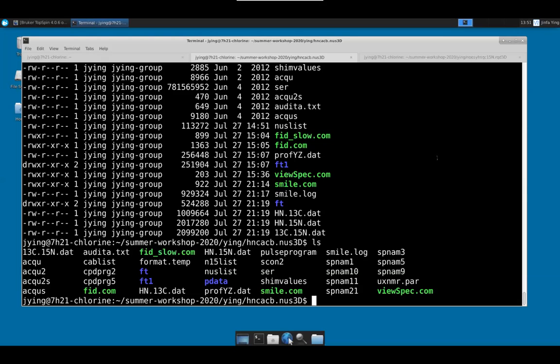The default is 6.5 microseconds. You could set it to 30, 40, and of course that will screw up your linear phase, but you could actually compensate for that in the pulse sequence. If you have an echo right before detection, you can always account for that delay.